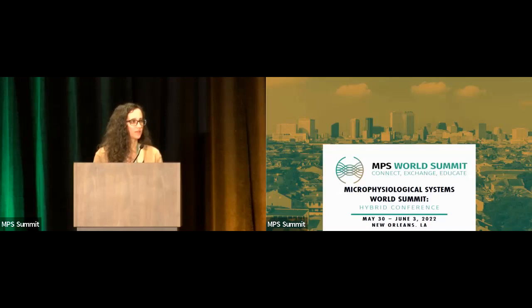I think you were asking about the difference between the OAT1 overexpressing cells and the RPTEC cells. Yes. It's primarily going to be the fact that OAT1 is very highly expressed in those overexpressing cells. I do believe they also have very nice expression of PGP and MRP2. RPTEC have them as well, but I'm not sure if you noticed in the table, when we applied our known compounds, we had more of an effect in the OAT1 overexpressing cells than in the RPTEC cells. I suspect it's due to higher expression of most of the transporters. Very well. Thank you very much.